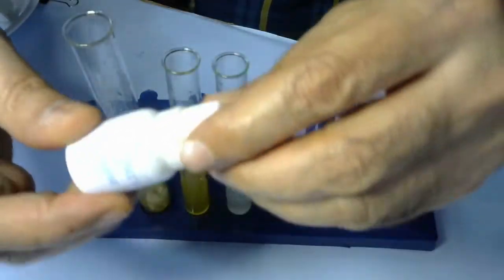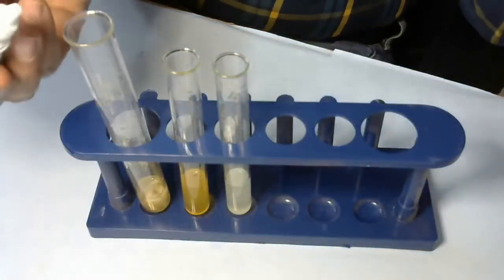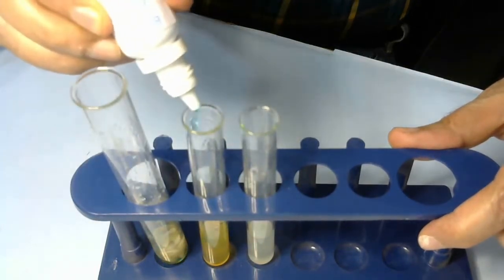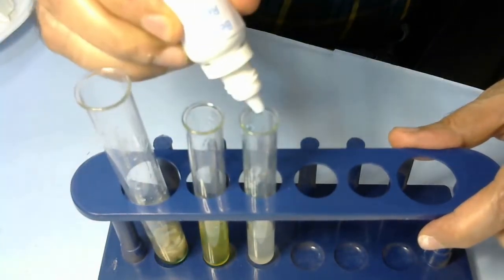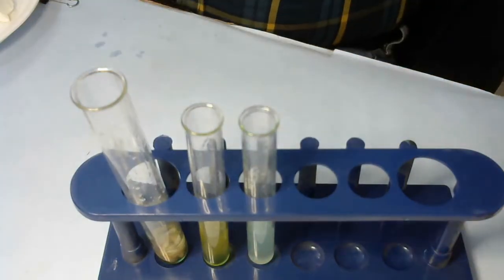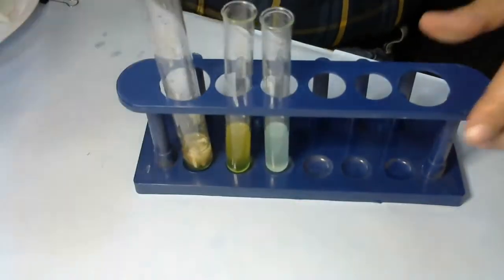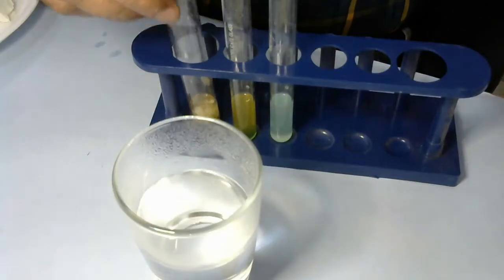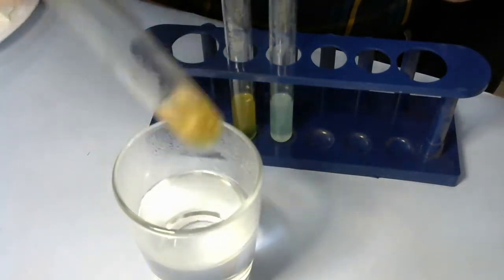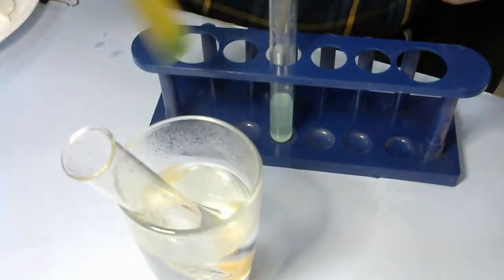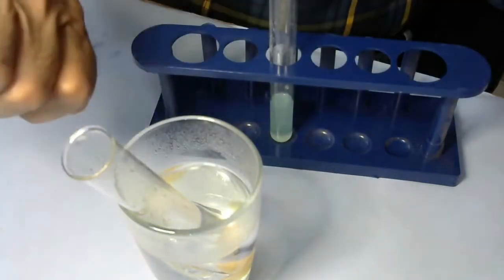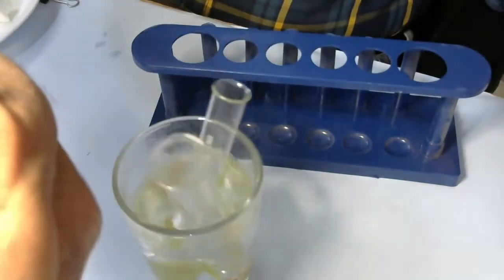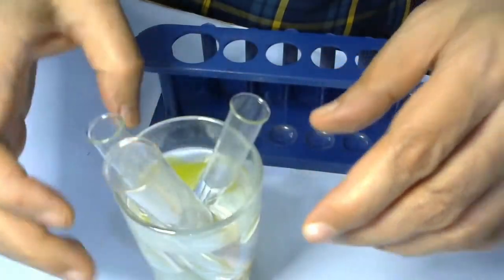For testing purposes, we're taking Benedict's reagent and will add about 10 to 15 drops in each test tube. Now we have to keep these test tubes in hot water. We've taken hot water into a glass. After mixing a little bit, we have to dip these test tubes. We've shaken the test tubes so the Benedict's reagent mixes with the solution, and now we've kept them in hot water.